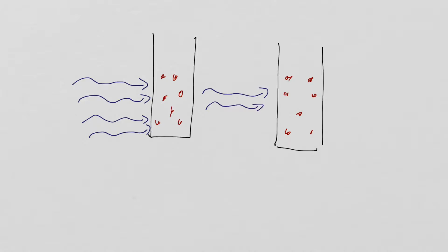Ah, that's interesting. I like your thinking. I really like your thinking. We said here 50% of the light goes through. Yeah? So if we shine a little bit less light, then it's probably that, again, 50% goes through. Yeah? So maybe only 1 goes through.